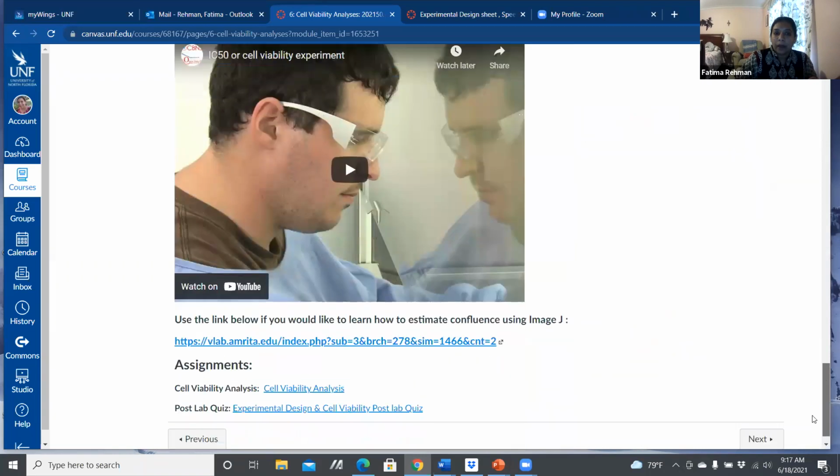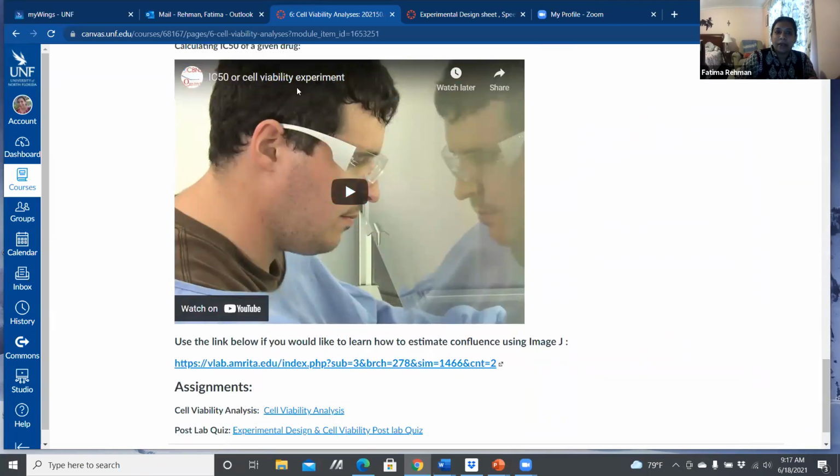Okay. The last thing that I have in here is calculating the IC50 of a given drug. Does anyone know what an IC50 is? Especially those who've taken chemistry, I think. I can't see the chat, so I don't know if somebody is writing in the chat.